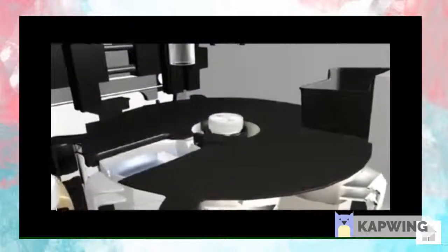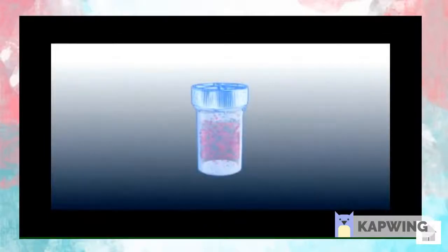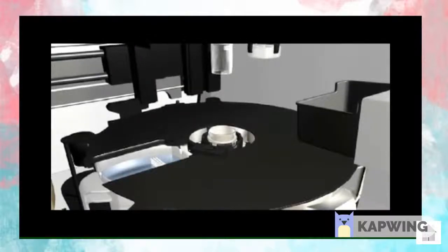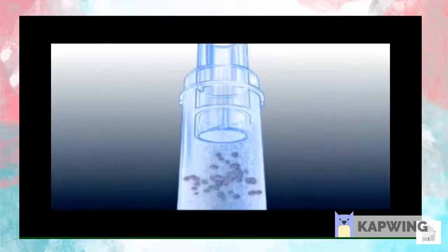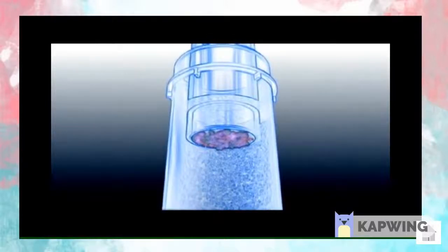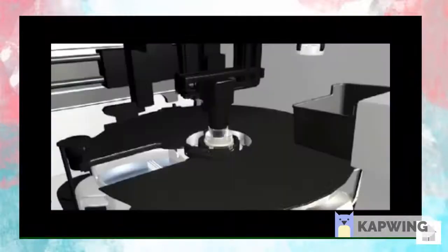the ThinPrep vial is spun creating currents that are strong enough to separate debris, disperse mucus and randomize cells, yet gentle enough to have no adverse effect on cell morphology. The ThinPrep Pap test filter is inserted into the sample vial. A gentle vacuum is created within the filter. Cell collection is controlled by the ThinPrep 5000 processor, ensuring that just enough of the sample is collected to create an optimal thin layer of cells in a 20mm circle.